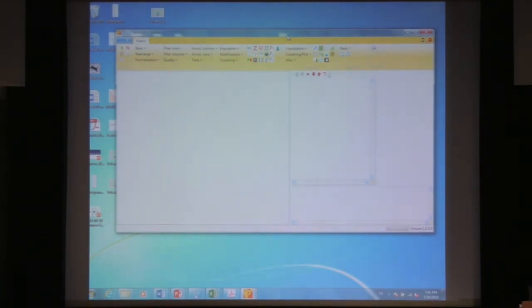Alright, so we get started with the PTM tutorial. We'll go through some of the things that we can do specifically with relation to PTM data. This is obviously geared towards phospho because that's the data set we're working with, but many of the steps are generic, so should be reasonably applied to other PTMs.